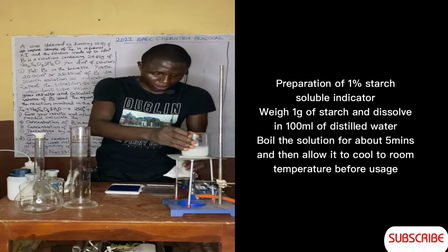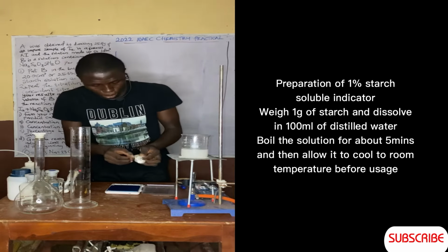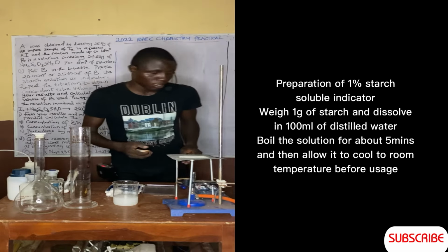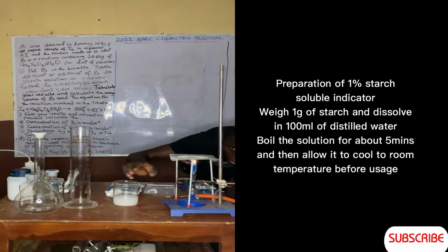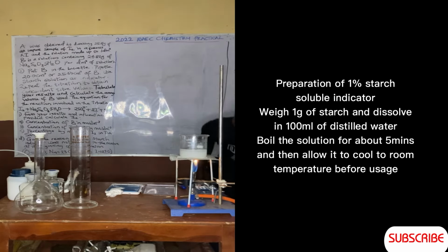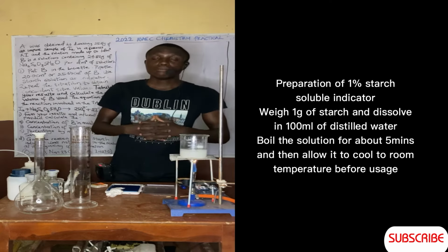I'm going to place this on the tripod stand, and you can see that my Bunsen burner is there already. So what I'm going to do now is put on the Bunsen burner, then you heat it for the next 5 minutes.